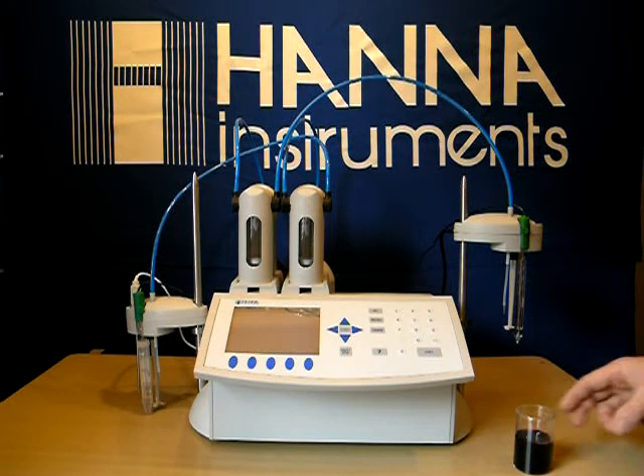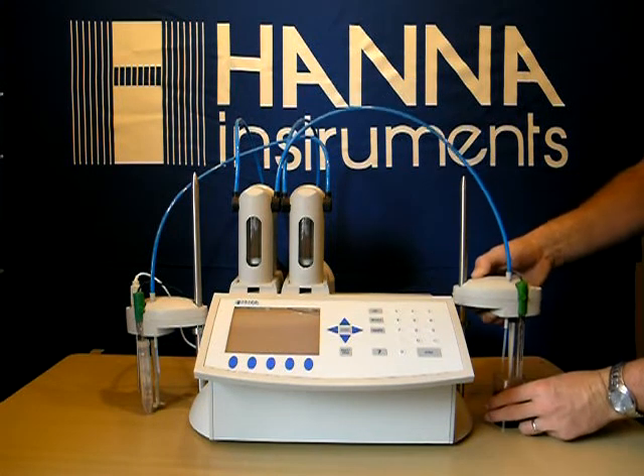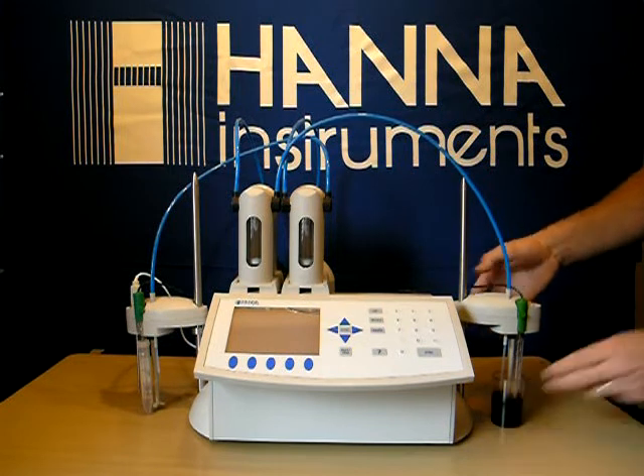5 milliliters of our 84100-53 — this is our acid reagent for free SO2 — and one packet of 84100-54 powder stabilizer. So we've added those.